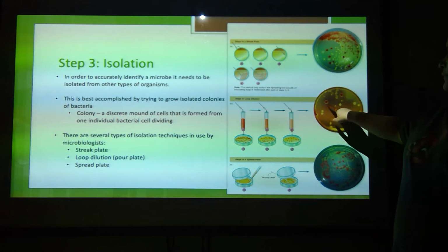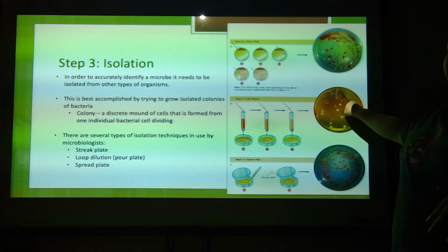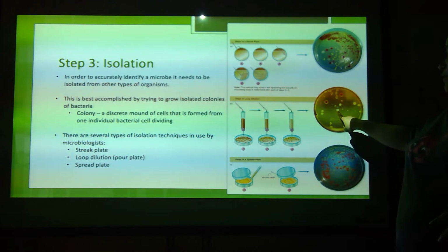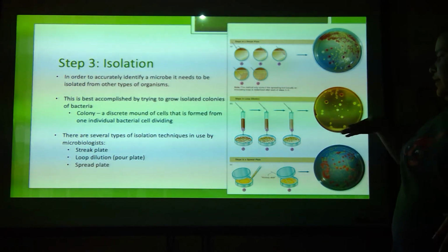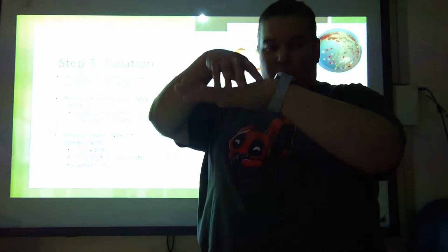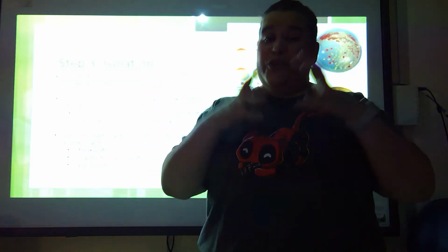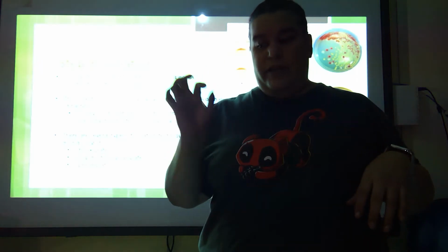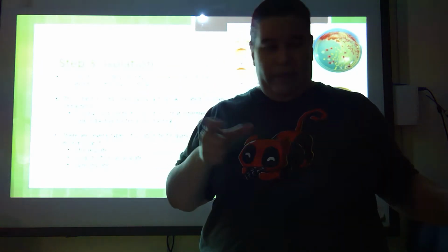If we go back, what are these? Well, let's say I've got a red colony. It's circular. I've got, I don't know, an off-white colony. It's circular. If I look at it, is it popped above the agar or is it concave like it dug into the agar? All of these are macroscopic, big, with my naked eye, things that I can observe about what's growing on that plate.